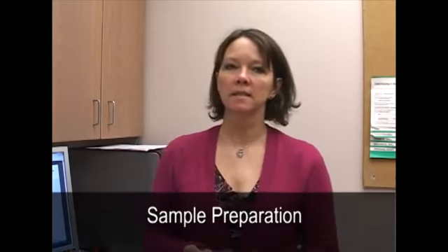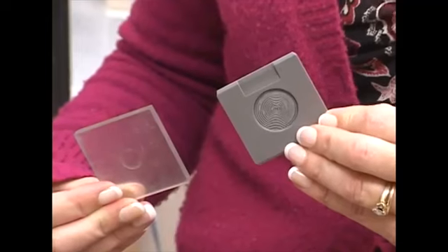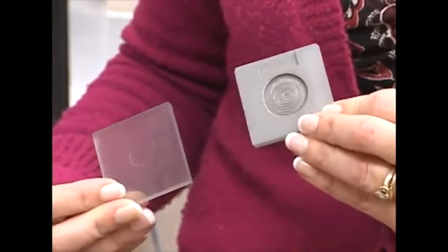So now we're going to discuss sample preparation. For X-ray powder diffraction, it is important to have a well-defined polycrystalline material. And the individual particle sizes of your material should be below 45 microns. You need enough to fill one of these wells, and it should be packed in.